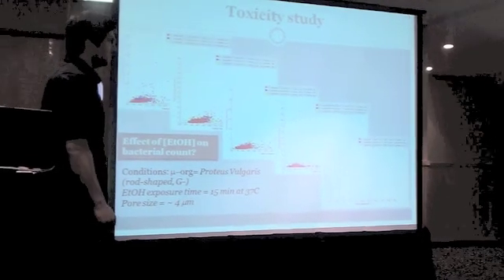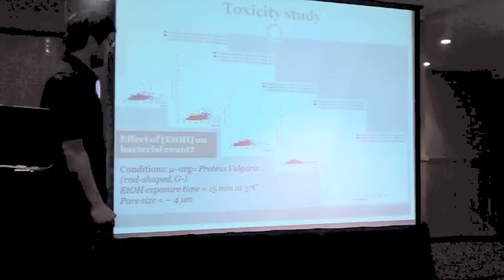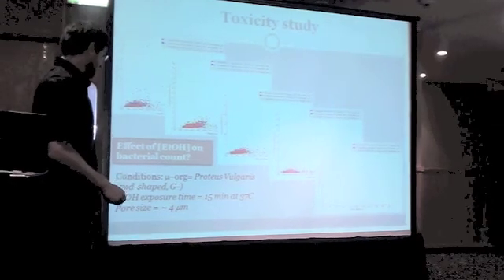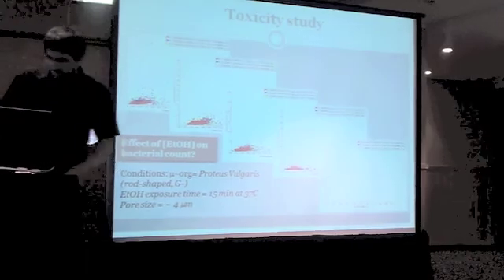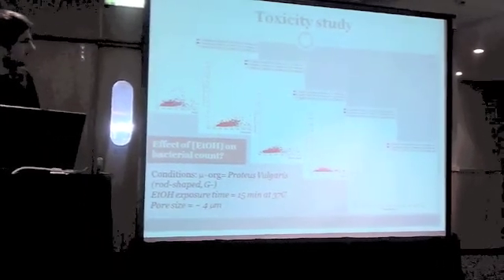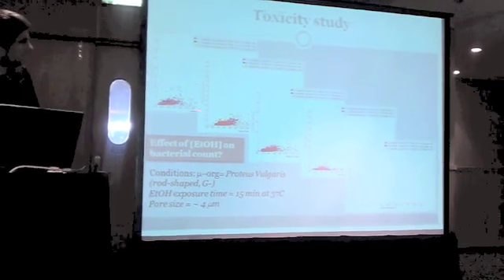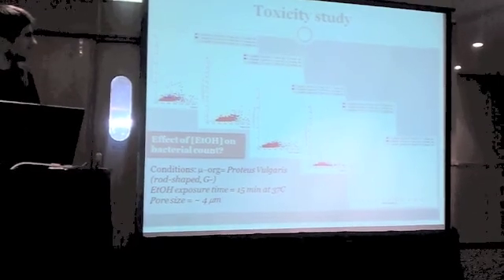You find infections with Proteus vulgaris, nosocomial infections, in the hospital. This is again a rod-shaped and gram-negative bacteria. So if you look at it initially, what you see is quite encouraging. This is increasing dose of ethanol as a model toxin. So the blockade rate is gradually decreasing, and this is exactly what I wanted to see.